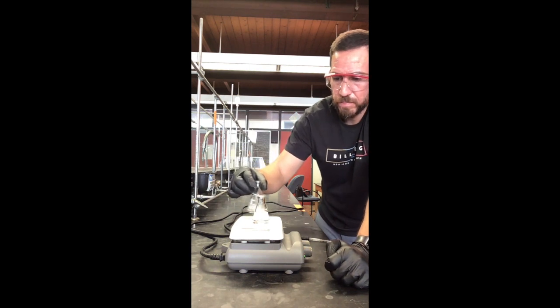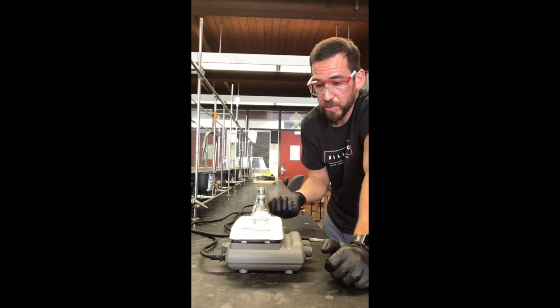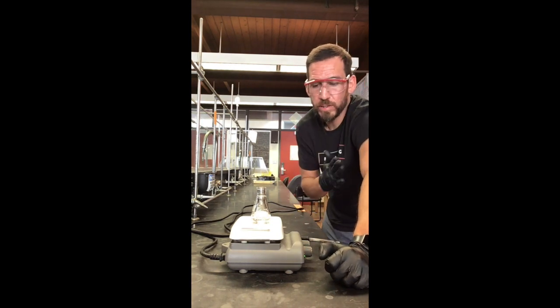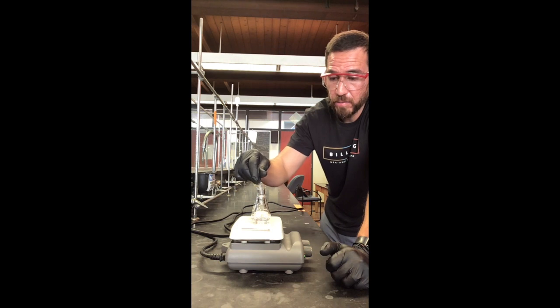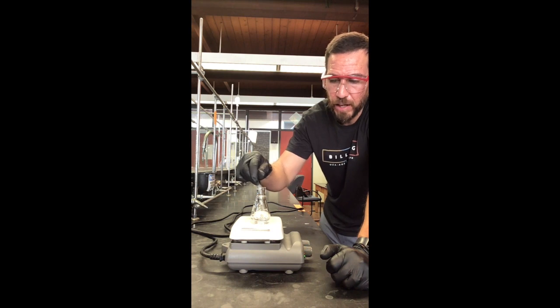just a few crystals. And, not to bombard you with a ton of information, but in a laboratory, if I had some stubborn material that really just didn't want to dissolve, what I could do is filter that off, because maybe that's not actually caffeine, maybe that's some other impurity that's in here, and I don't want it in there. And so I could also always filter that off really quick and then continue with the recrystallization process afterwards, just to ensure that I get the purest possible sample.